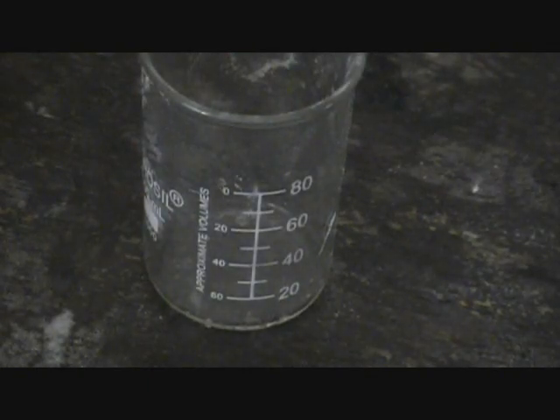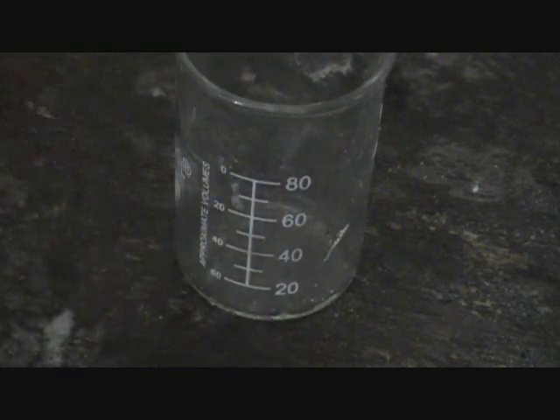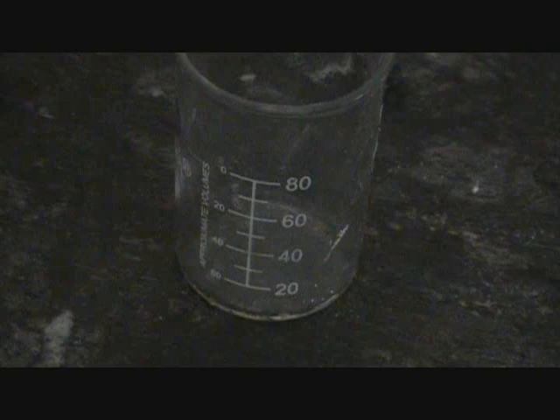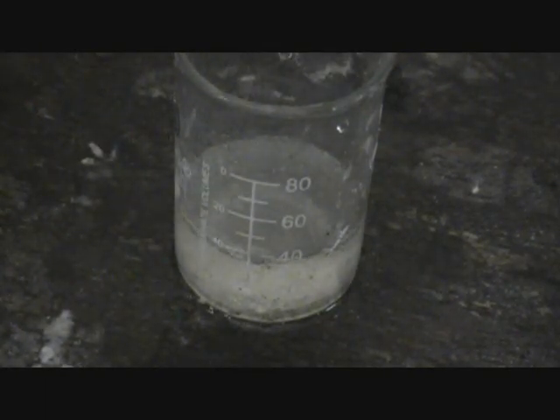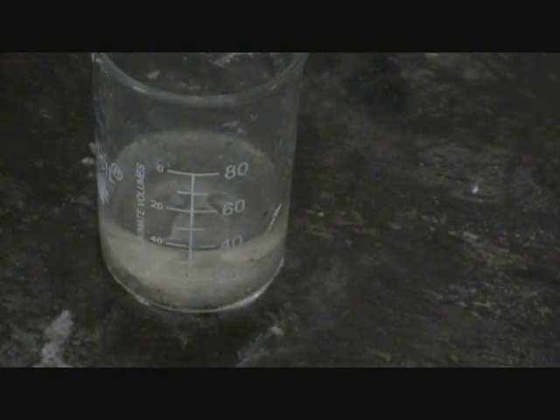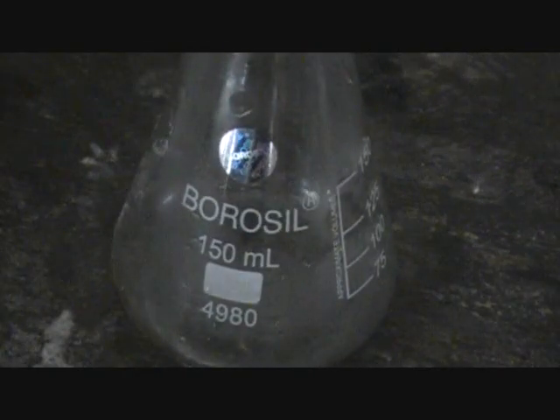This is how to make oxygen. First, what you'll need to do is measure out 40 milliliters of bleach. The solution should be clear, and then pour it into a 150 milliliter flask.